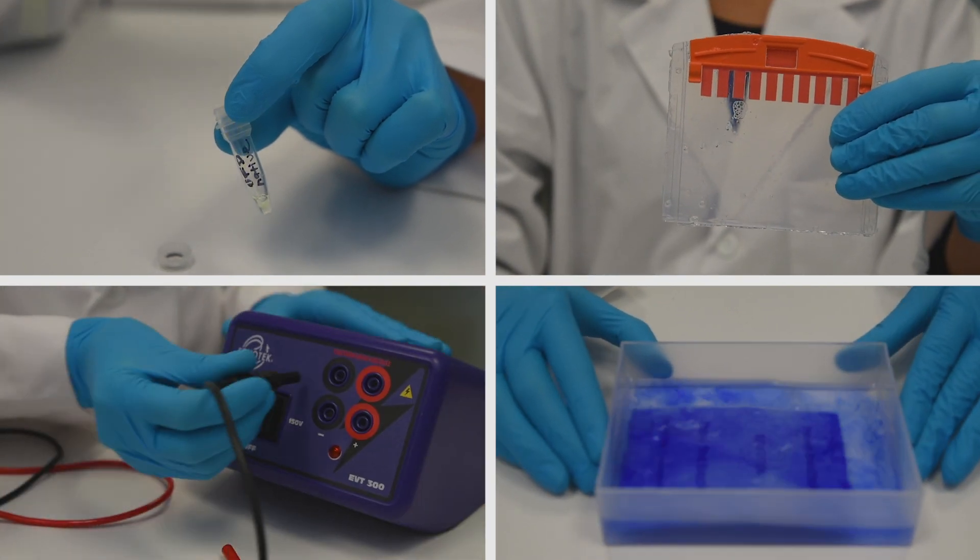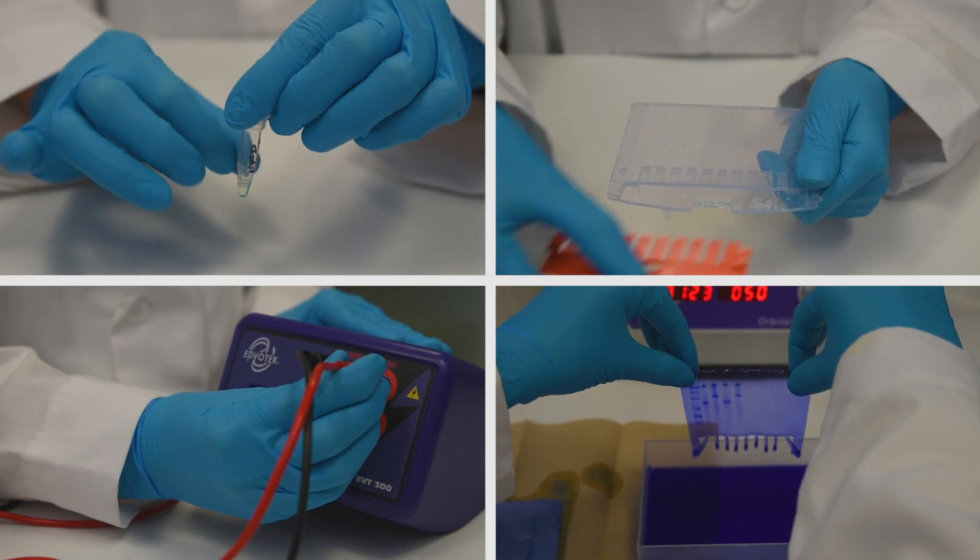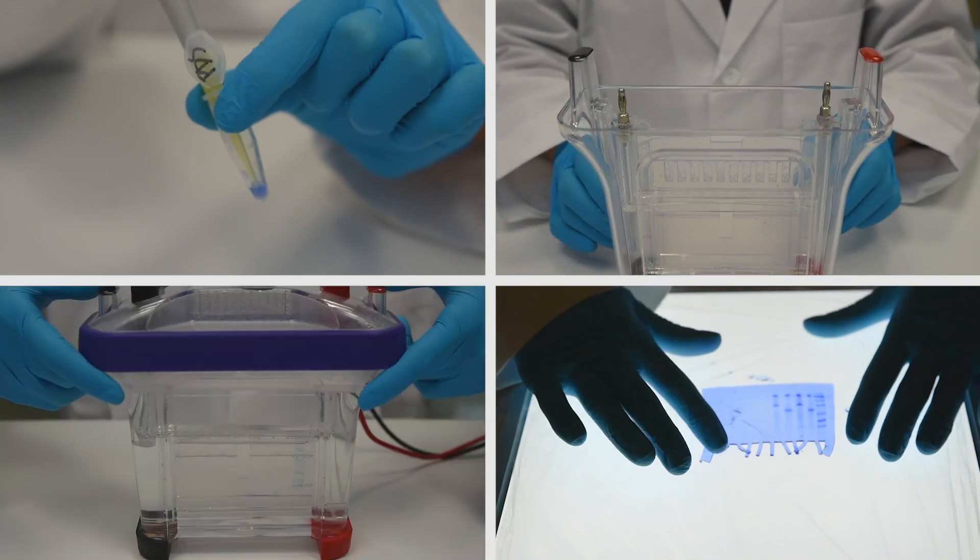Native samples will be mixed with glycerol, while denatured samples will be mixed with a denaturing solution and boiled. Both samples will then be run on an SDS PAGE gel and analyzed.